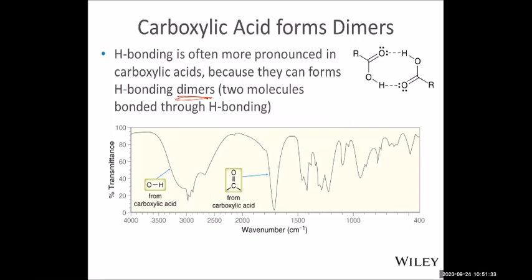So I would expect around 1700, maybe slightly less than 1700. Because the carbon-carbon double bond is linked with the carbonyl, you should have a very strong 1700, but the wave number is less than the typical 1720. And then finally the carbon-carbon double bond should have about 1600 wave number, but oftentimes it is difficult to identify. They're often mixed with other absorptions. So as far as the diagnostic, we focus on the ones we see in those numbers. And the carbon-carbon double bond we typically do not look at.